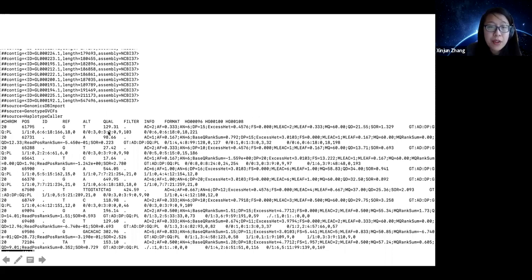Say, for example, for the first position that we got, we have 3 individuals and 2 of them are zeros. They are not variants in contrast to the reference genome, but since one of the individuals is homozygous for the alternate allele, this entire site is included as a variant in this jointly called VCF file.